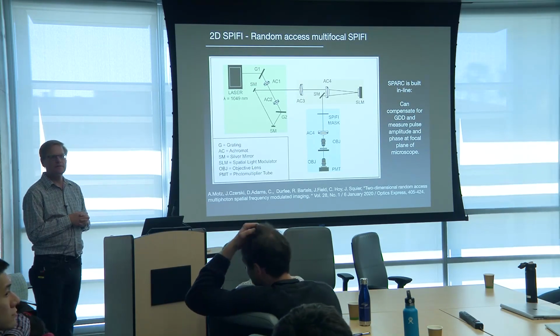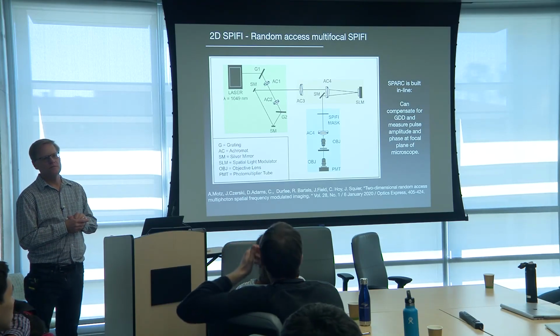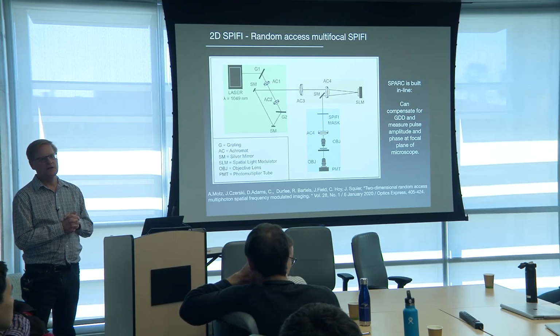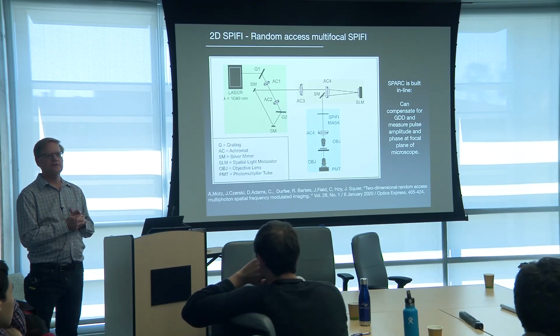So you've got a lot of example things that you've imaged with SPIFFI. One of the things that should be nice about it is that it should be relatively impervious to scattering. Do you have examples that you've taken deep into scattering tissue? I haven't, but that's where I'd like to go. We need to do that. I think that would be really powerful.